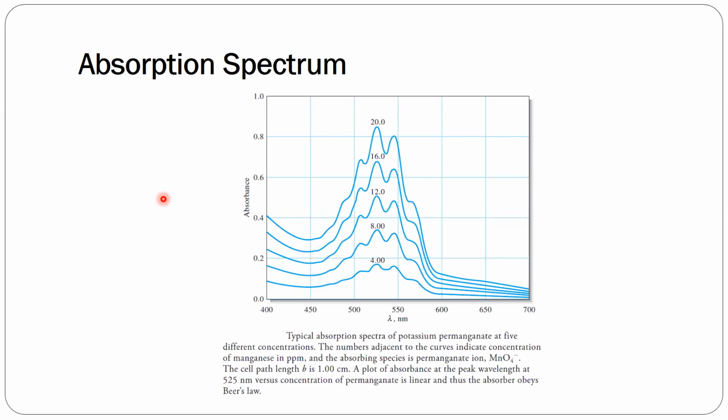Here I'm showing yung plot ng absorbance versus wavelength. Remember, if you are going to do a measurement, okay, let's say you want to determine the absorbance of a series of samples, of course using the same kind of sample, okay, pero you have, let's say, an aliquot of that. So, ang ginagawa is you will scan first using the spectrophotometer kung ano yung gagamitin nating wavelength of absorption. Because, of course, naturally, we would go for the wavelength. We will use the wavelength in the light kung saan maximum yung absorption. Okay, so we call that the absorption spectrum. So it's the plot of absorbance versus your wavelength.